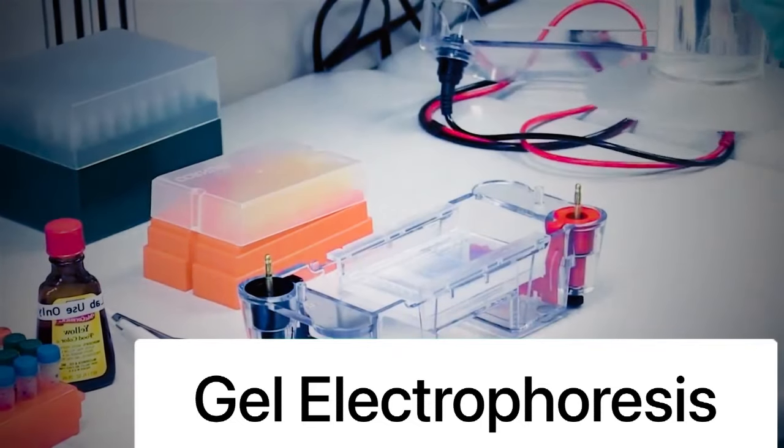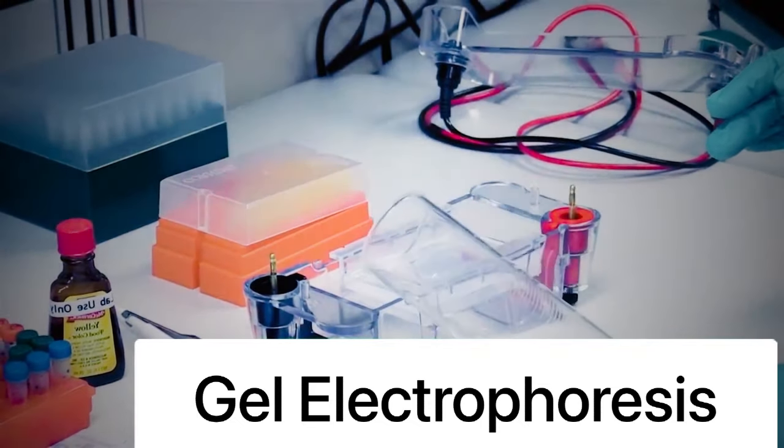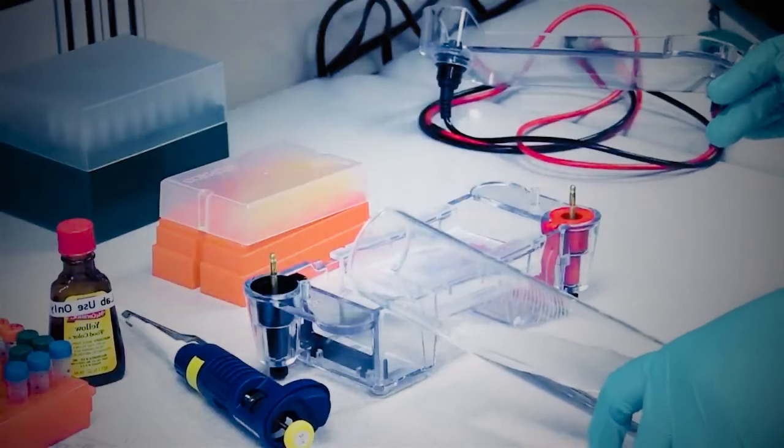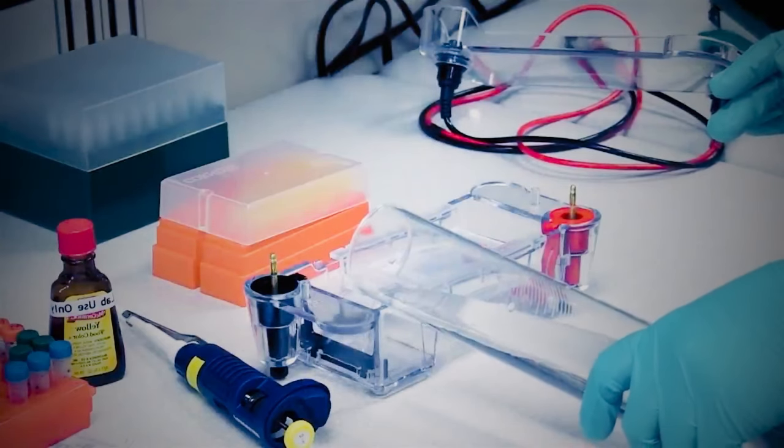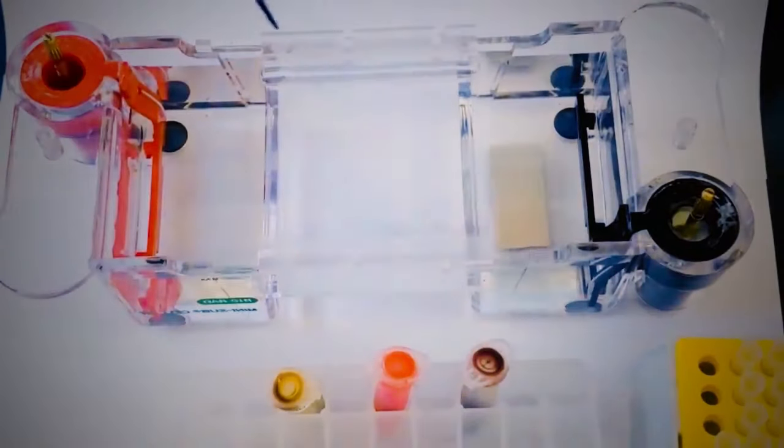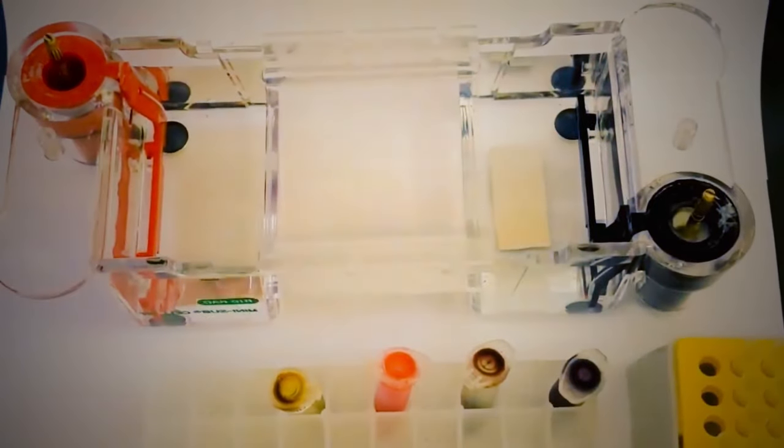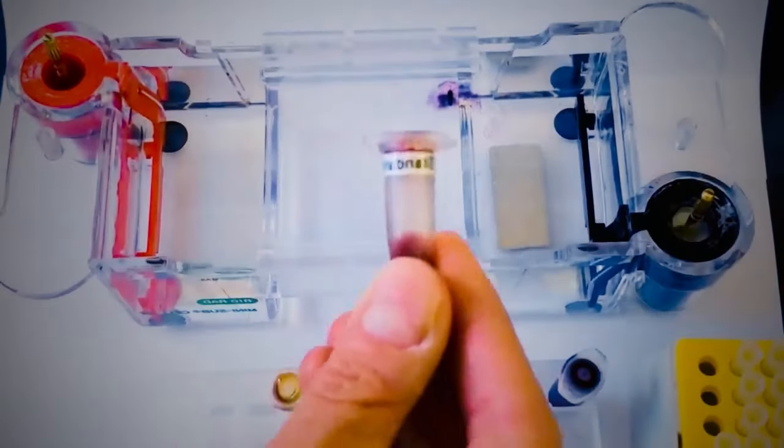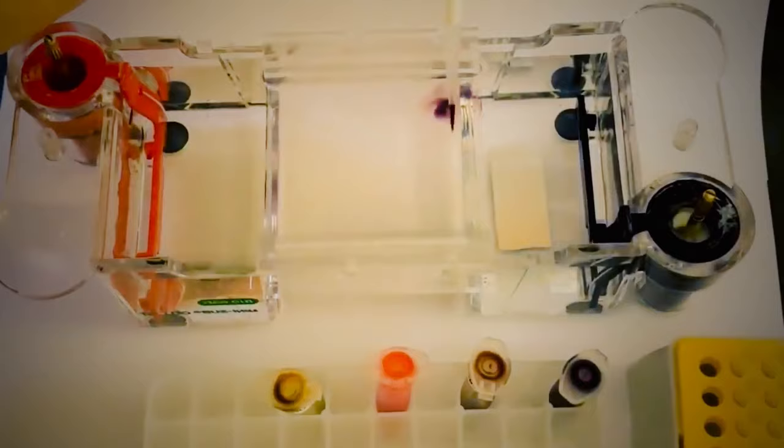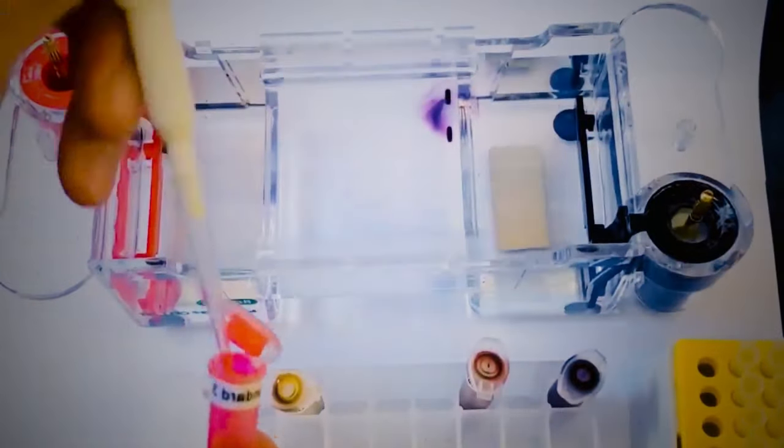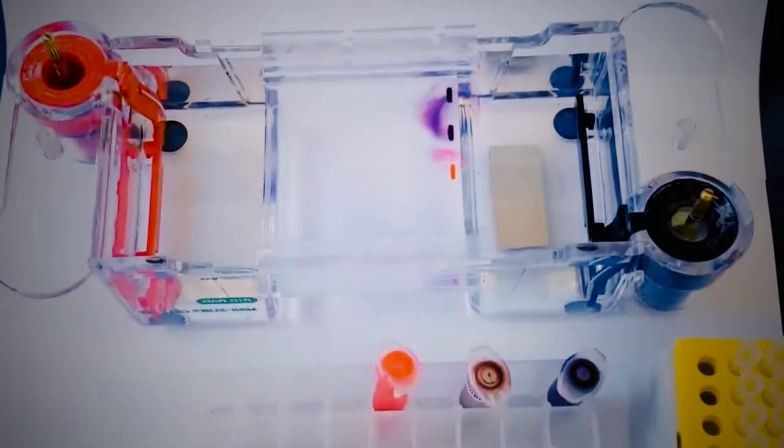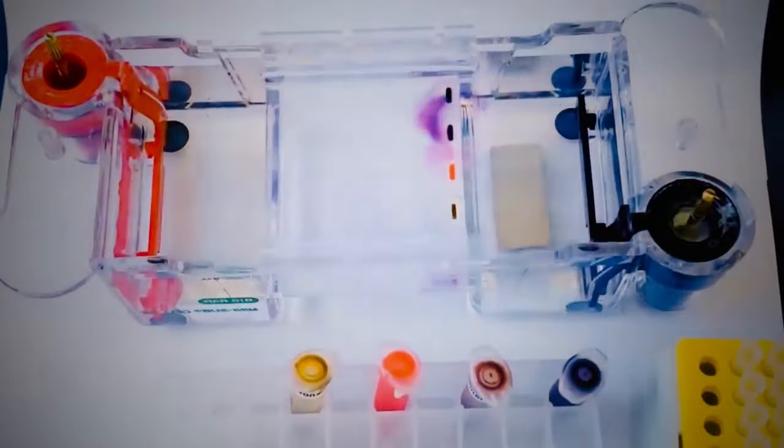Gel electrophoresis. Agarose gel electrophoresis is a well-established technique routinely used in clinical laboratories for screening protein abnormalities in various biological fluids, such as serum, urine, and CSF. Electrophoretograms are evaluated visually for the presence of quantitatively or qualitatively abnormal protein bands.